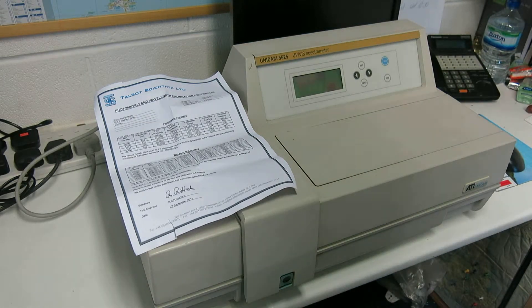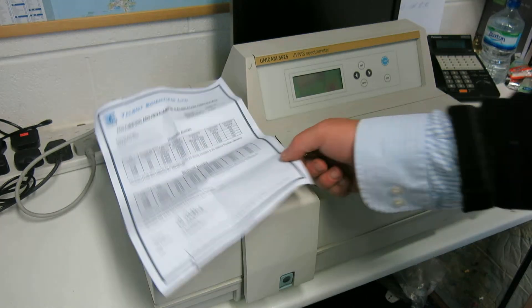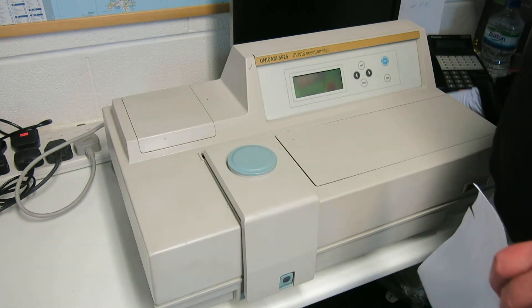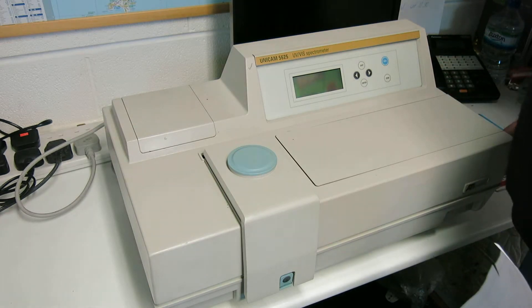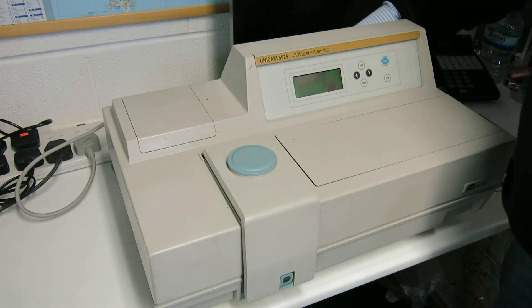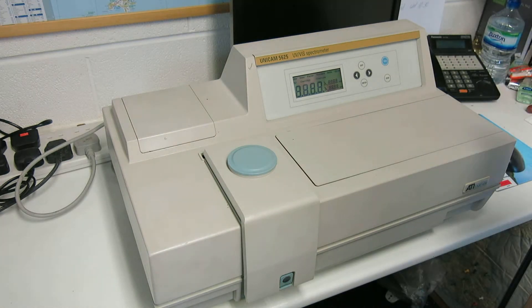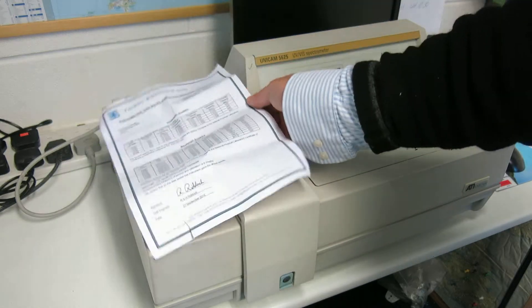This is a Unicam 5625 UV-Vis spectrometer. I'm just going to switch the instrument on now. This was last serviced by Talbot Scientific on 27th September 2012 — that's the test certificate for it. It was done 12 months ago.